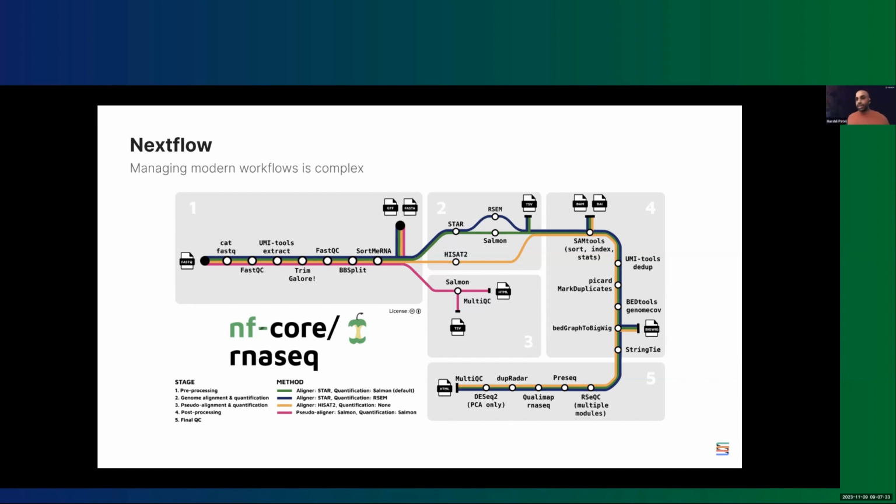It's generally, again, via consensus decisions across the community to iterate on making these pipelines better, not only from a functional perspective, like having different routes and analysis processes in the pipeline, but also in terms of how best to write Nextflow pipelines. So each pipeline is a series of steps, as you can see here in this tube map.